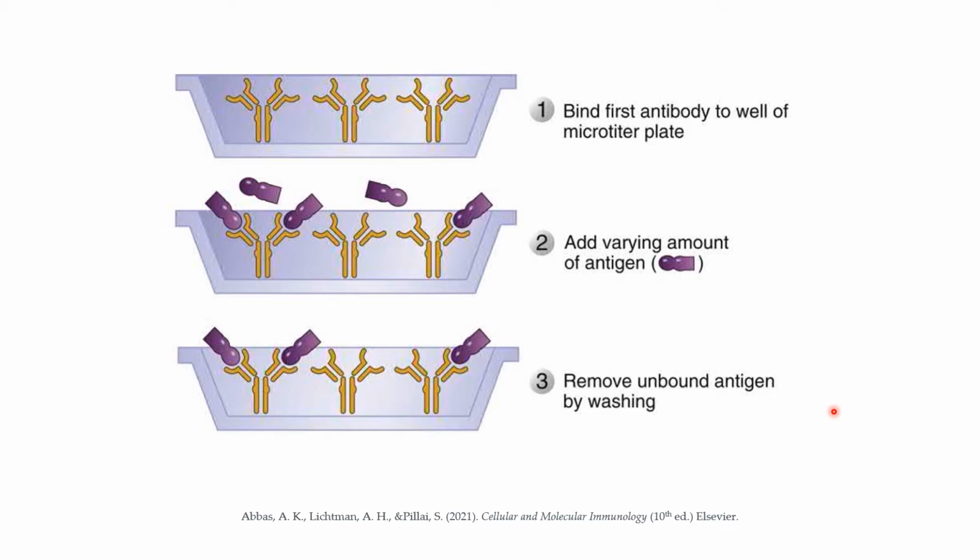So what you do is you put a couple of layers of paper towels on your lab bench, and then you turn the plate upside down and then you bang it onto your lab bench, like bang, bang, bang, because you really want to get rid of the unbound proteins. So they won't be there when we run the plate in our ELISA machine later.